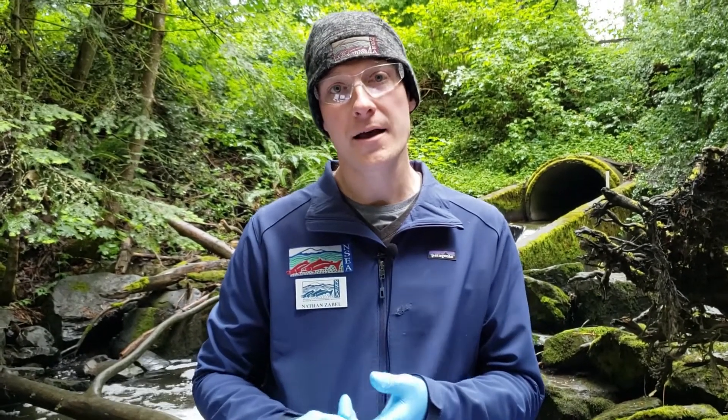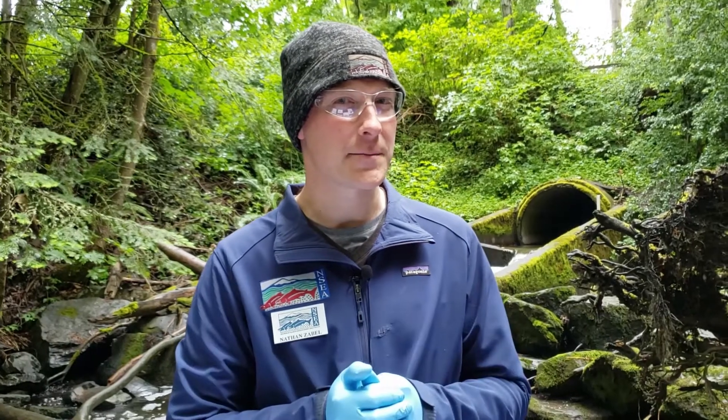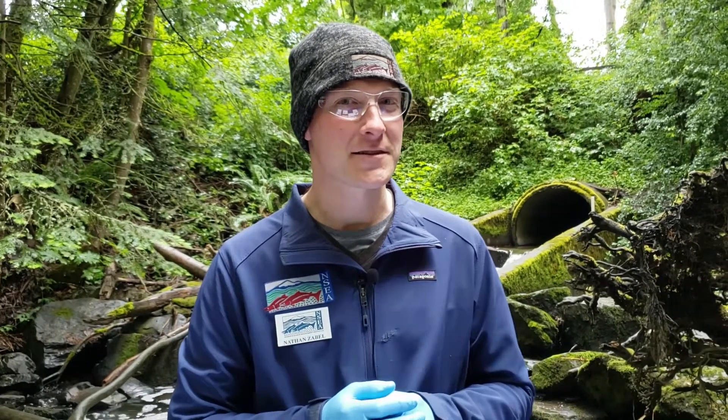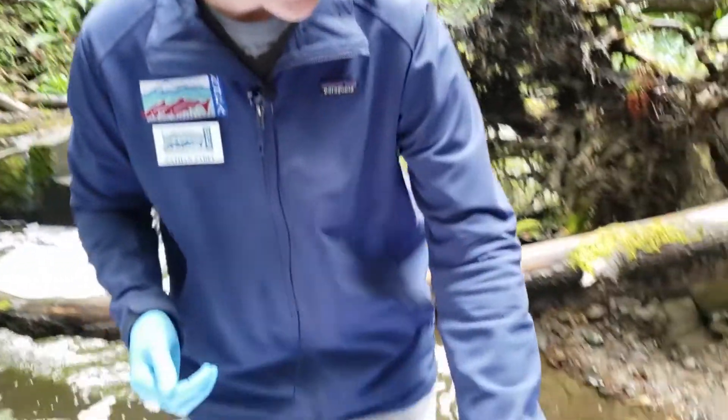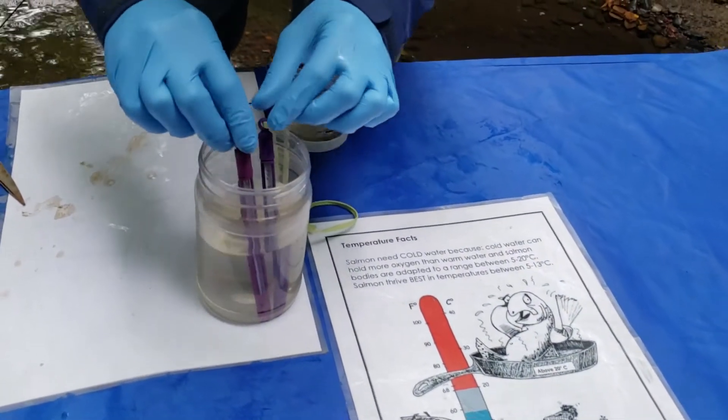We'll jump into another test while we wait, and that second test is temperature. One of our three C's is cold, and you learned in one of our earlier videos that salmon prefer cold water. Cold water tends to hold more oxygen, their eggs can survive in colder temperatures, and it's easier for adults to breathe and survive in cold water environments. So how do we test temperature? We're going to use a thermometer to test the temperature of Padden Creek. We'll refer to our water sample collected this morning.